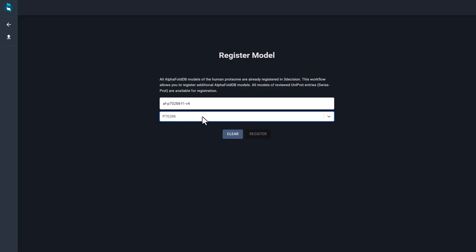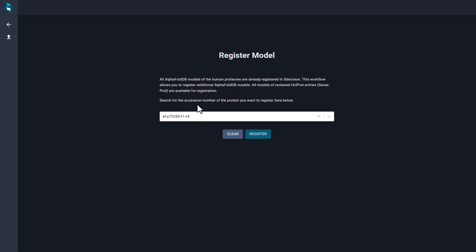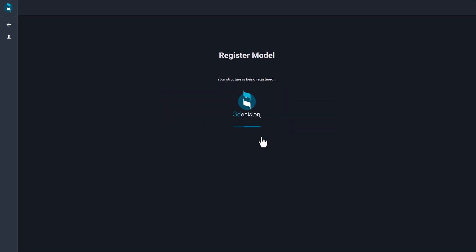You just need the UniProt accession code of the structure you want to add, and in a few seconds, the AlphaFold model will be added to the 3Decision database.